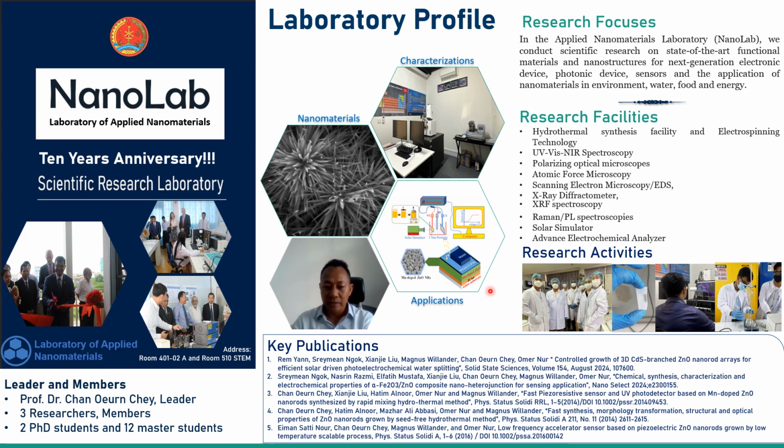Recently, we have published different research papers on water splitting technologies based on nanomaterials. As you can see from our list of publications here, I will also show you some research activity in the lab. We have researchers who come here, we have our samples, and we have people working on different applications here.